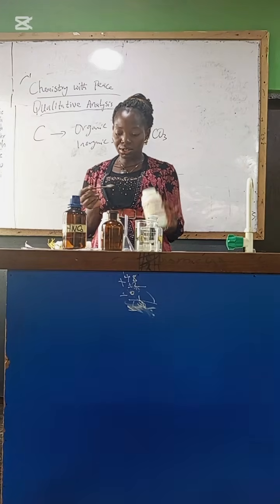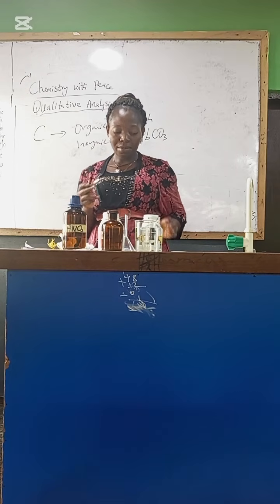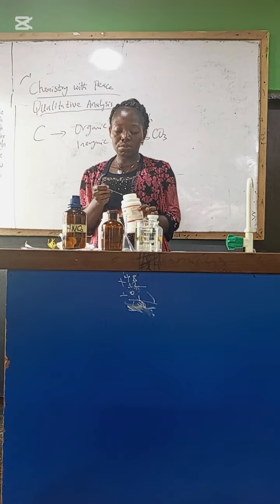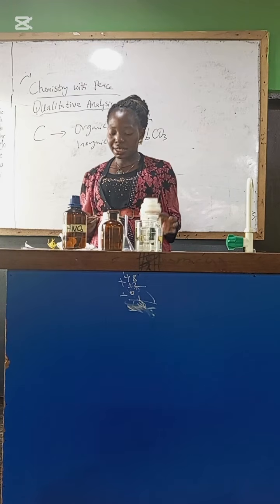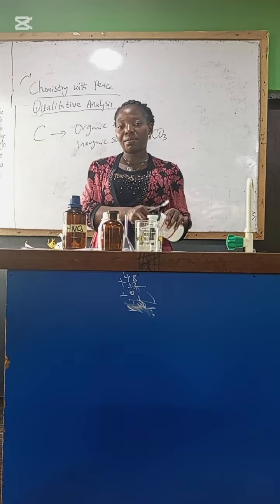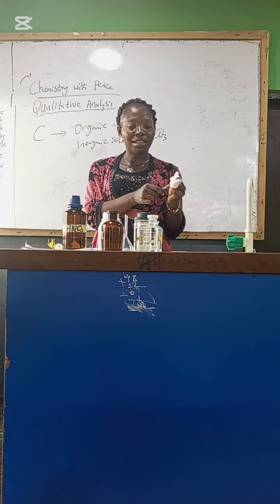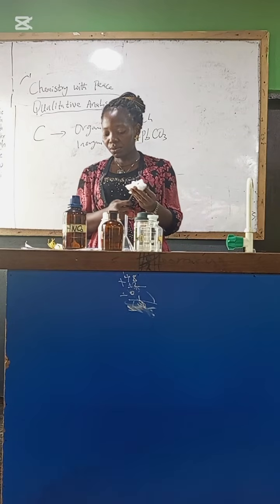So this is our salt, this is our spatula. This is one spatula full of lead carbonate. You can see I'm cleaning the spatula very well with cotton wool.